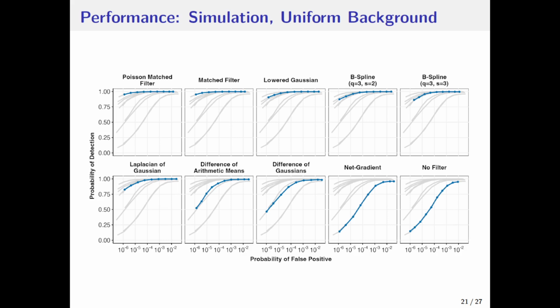So the result is it would need some improvement to be useful, right? You mean the net gradient? Yeah. I just don't think it works so nicely. Well, these data sets include molecules that are not super shining. If we compare performance on the data with super shining molecules, most of the filters will be very close to 100%, or the differences would not be so big.